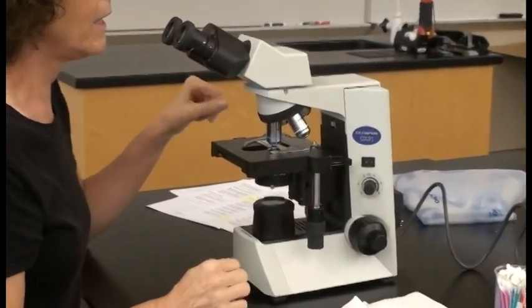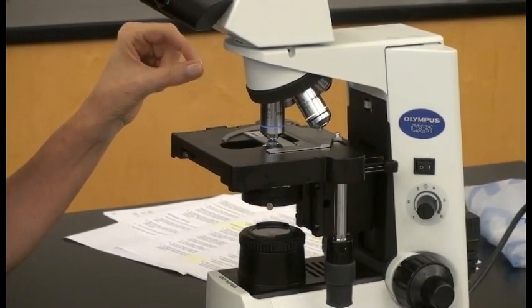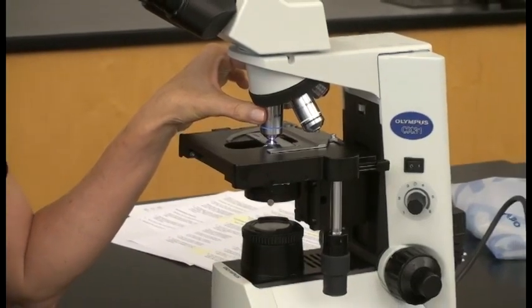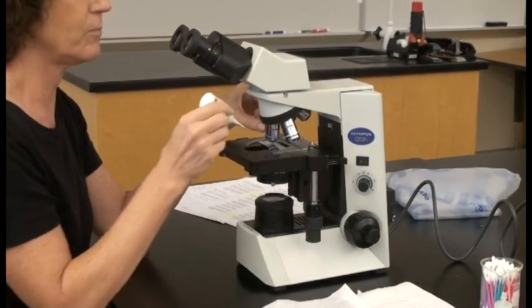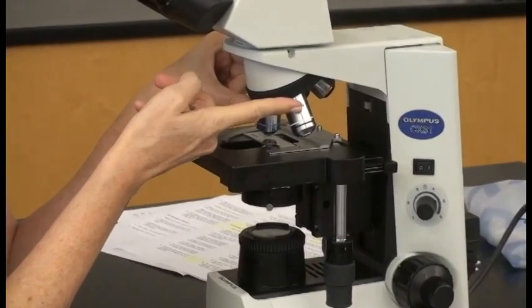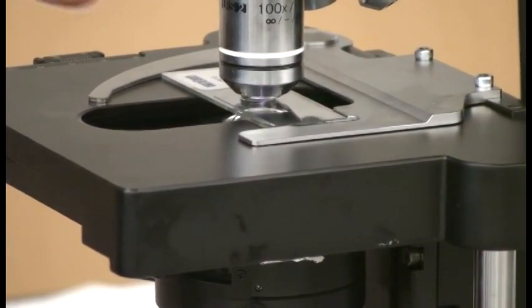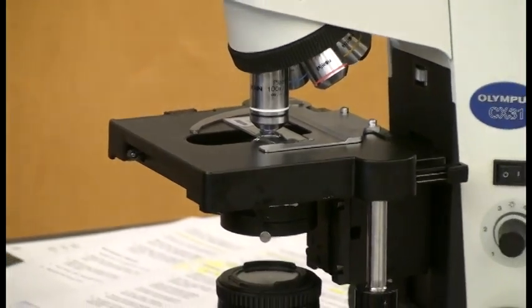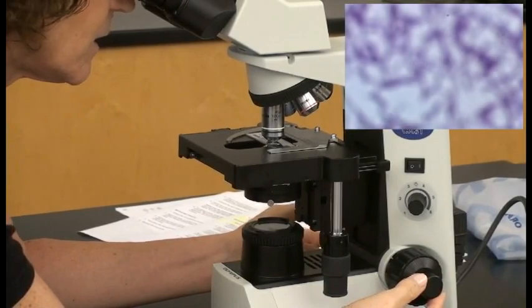After focusing under 40x, we want to use the oil immersion lens, which gives the highest magnification — 1000 times the actual size. To use it, you have to immerse the lens in oil using special immersion oil. Rotate the 40x objective out of the field and add a drop of oil to your slide, then rotate in the 100x objective into the oil. You have very little working distance, so use your fine focus knob and barely move it to see your object.